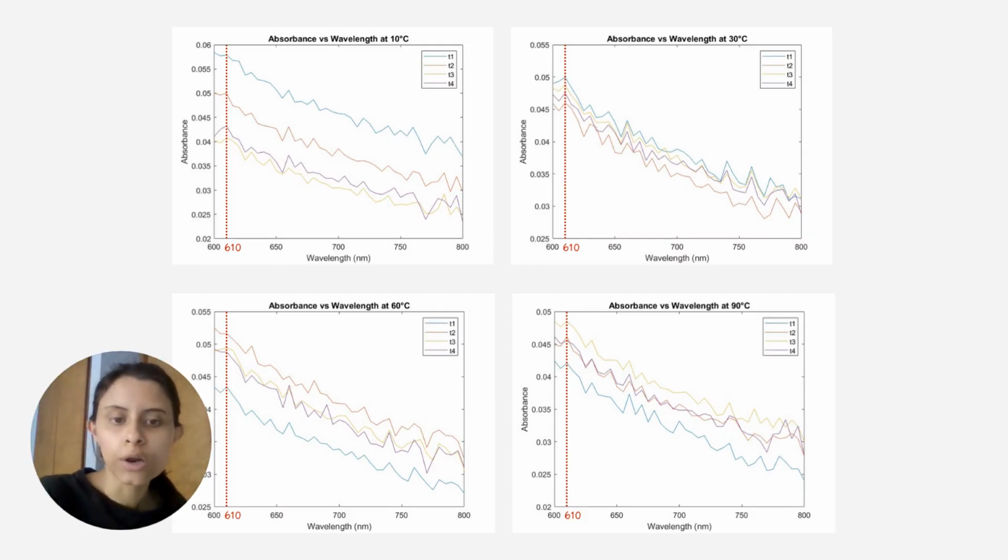Through the graphs regarding the wavelength versus the absorbance, it is possible to see how there is a peak at 610 nanometers. This means that at that wavelength, light was absorbed by the repellent. At that point, the quantity of absorbed light depended on the concentration of the solution. This is demonstrated by the fact that with bigger absorbance, there is bigger concentration.